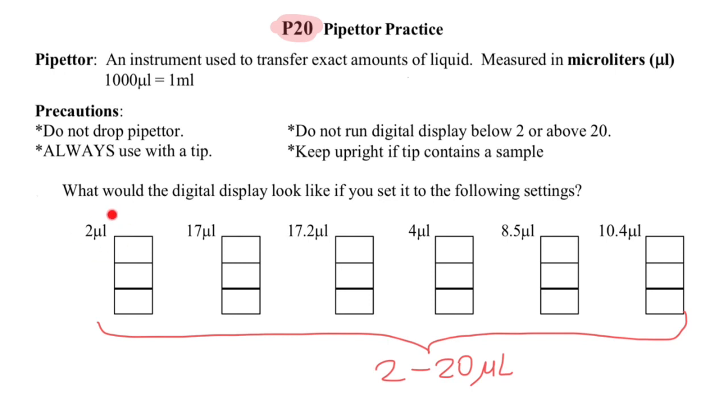So 2 microliters would be 2 here and 0 here. This thick line here represents the decimal point, so it means 2 microliters.